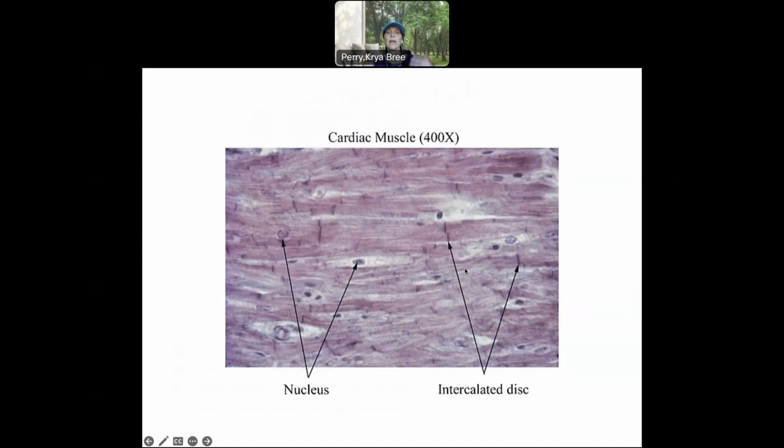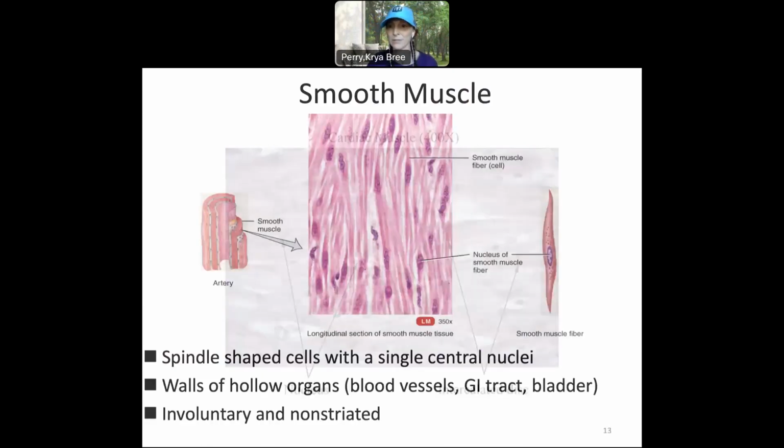And you say, oh, how would I know this is cardiac muscle tissue? Here it kind of looks like it might be skeletal muscle all squished together, right? But these cells aren't those really pretty, defined long cells like skeletal muscle, and boom, intercalated discs. Okay, so again, intercalated discs are a key giveaway. It should make it very easy for you to identify cardiac muscle tissue.